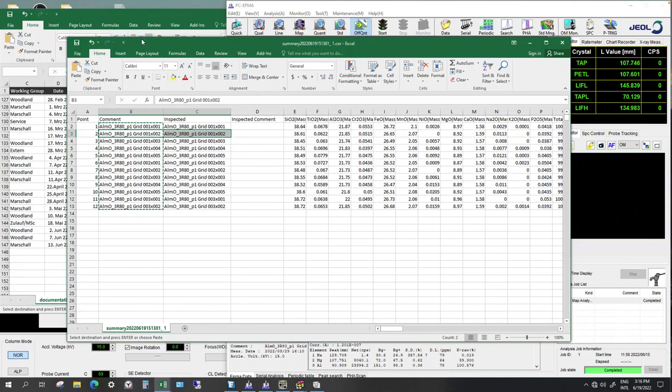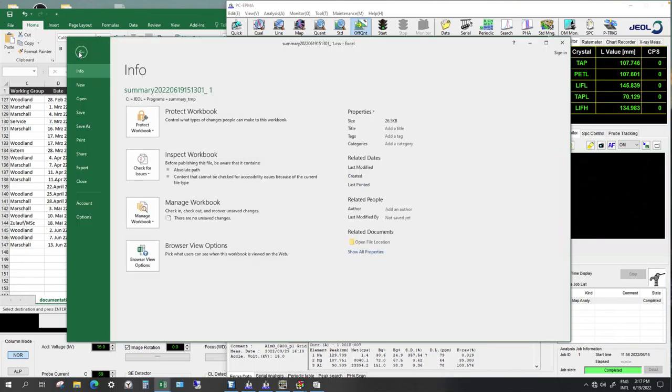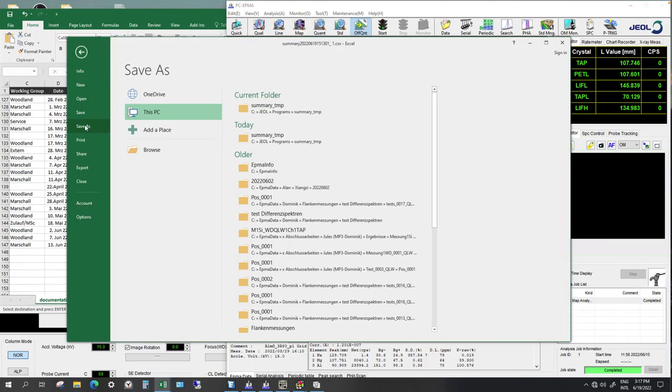And I recommend to also keep maybe an Excel file, but what you need for the flunk quant method is a CSV file. So you need to save it.